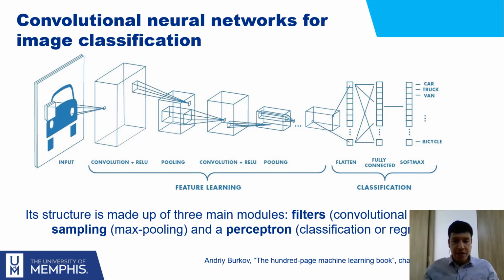The sampling layers, most usually max pooling layers, summarize the information in order to only highlight the details of the information in the preceding section. And the perceptron part is a regular classification model, in a simple and small form called a perceptron, that is used to easily classify by activating a given neuron, or in regression, by outputting in a single neuron a numerical value.